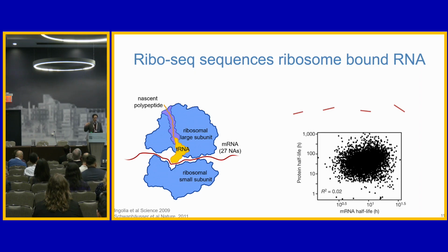This gets over the major hurdle with proteomic analysis using RNA-based work, which is that RNA doesn't actually represent what's going on in the cells at any given time point, right? It represents maybe what that cell is trying to do, but it doesn't represent what's changing in that cell. If you look at the half-lives, the turnover of specific proteins on the y-axis here, and the RNA turnover on the x-axis, there's basically a random scatter shot.